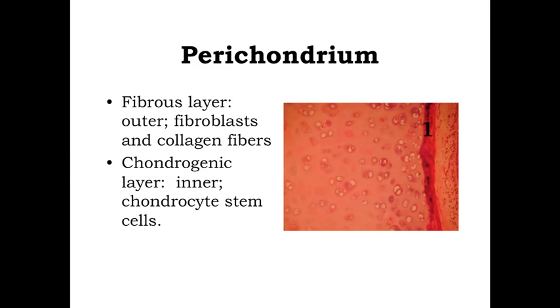If we take a look at the outside area of the cartilage, again in this one, we can see the cartilage in here to this point. Lots of really good cartilage cells here, kind of a nice even staining appearance throughout the rest of the cartilage matrix. Out here, we're going to have the perichondrium. Peri for around, chondrium for chondro, for cartilage. We've got the area around the cartilage.